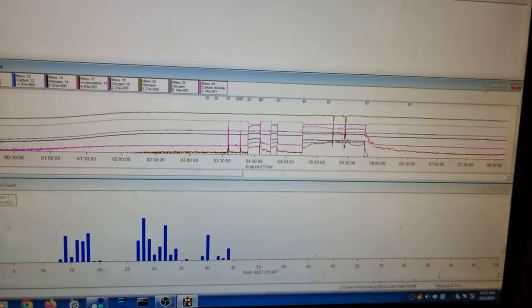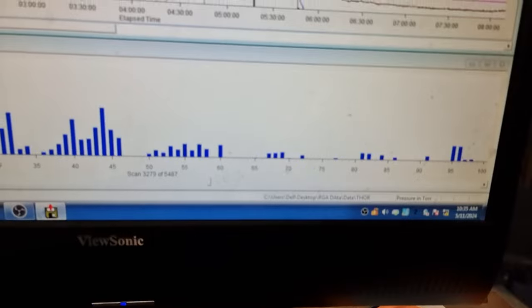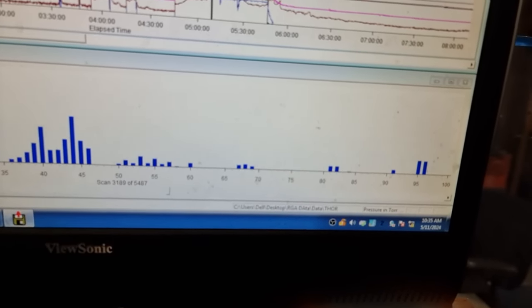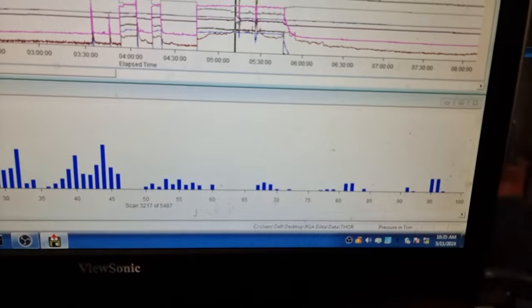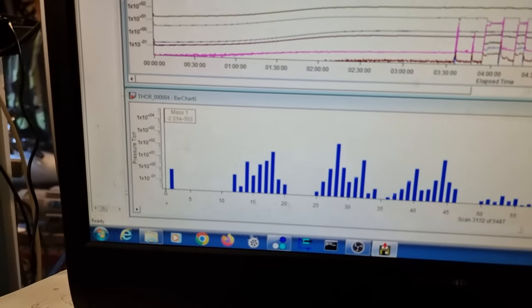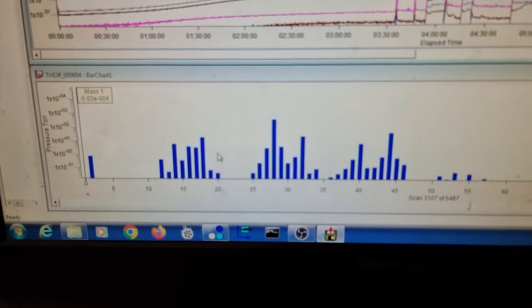So what we're going to do — what I'll be looking for is when it's under load, do we have less of these unburnt hydrocarbons coming out? If it's not doing its job, if we don't see those so much, then one could argue it is doing a little bit of cleaning potentially, with other reservations aside. And then do we see any other interesting things going on down here at the lower levels?